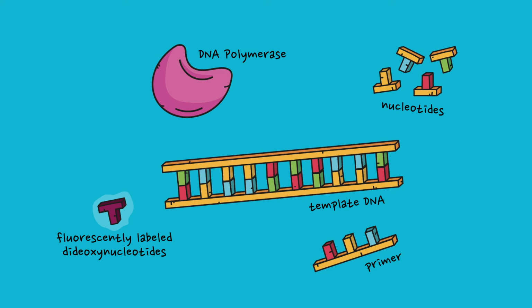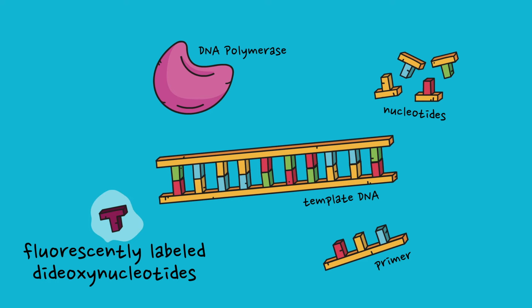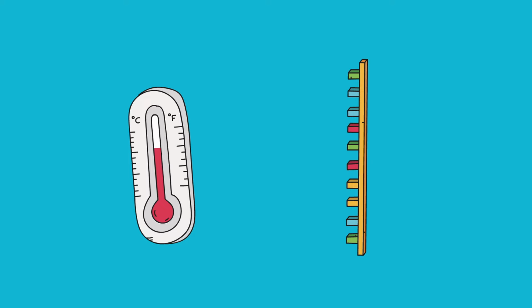The reaction involves template DNA, a primer, DNA polymerase, nucleotides, and fluorescently labeled dideoxynucleotides. First, the DNA is denatured and then cooled to allow the primer to bind.